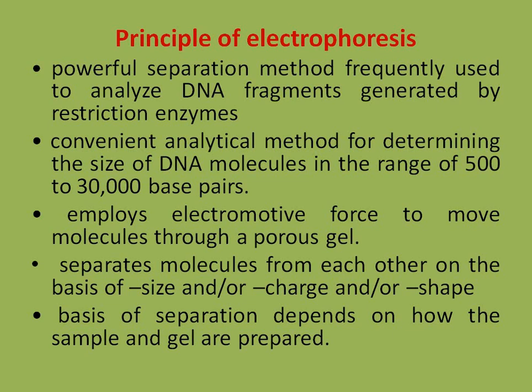The basis of separation depends on how the sample and gel are prepared. So different grades of agarose are used for different purposes of study, and in this way we can easily separate out the DNA samples in agarose gel.